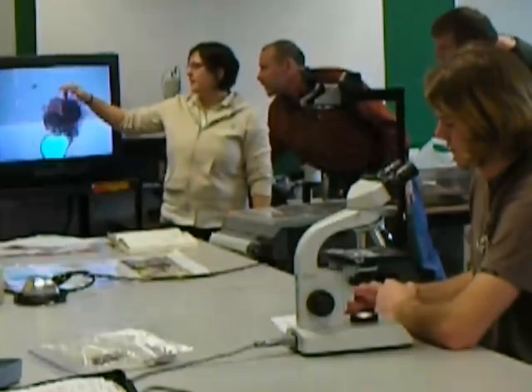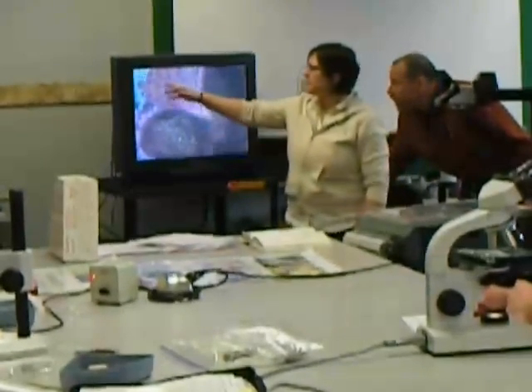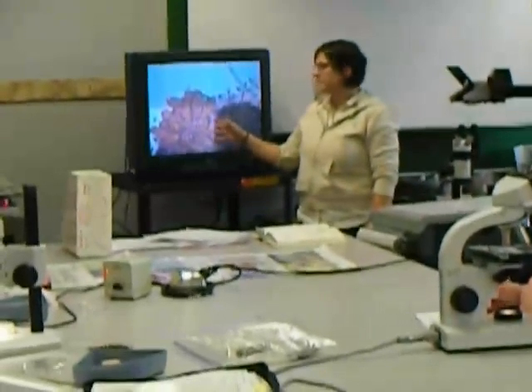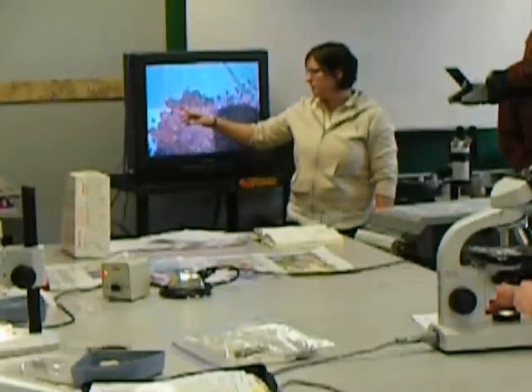When we zoomed in on it here, we magnified it. You can see right in here that these are a cluster, a grouping of the asci. They have — they're undergoing meiosis at the moment.